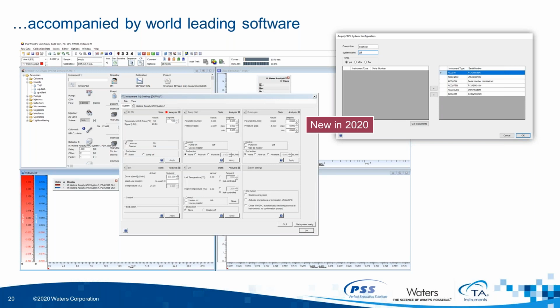So with this information, I could hopefully show you how a comprehensive 2D solution looks like. I could hopefully show you how to do that in a user-friendly way and how a 2D contour plot can be generated. And with this, I would like to hand over to Claudia so that she can share some nice examples and results with us. And she will also elucidate the data analysis capabilities of the WinGPC 2D software module.